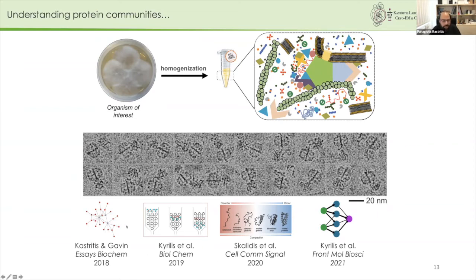So with Anne-Claude Gavin, we have tried to understand what kind of structural organization this is. And from my lab, we started to develop methods in order to simplify a bit this kind of cell extracts using size exclusion chromatography or sucrose gradients in order to separate, for example, the complexes by size and therefore to probe better and more efficiently their content.